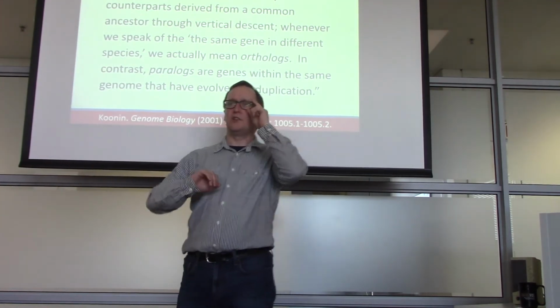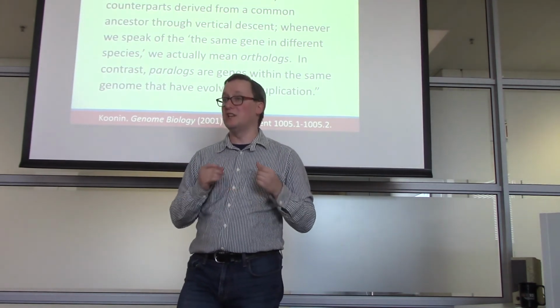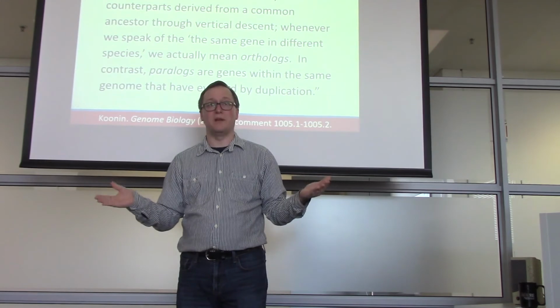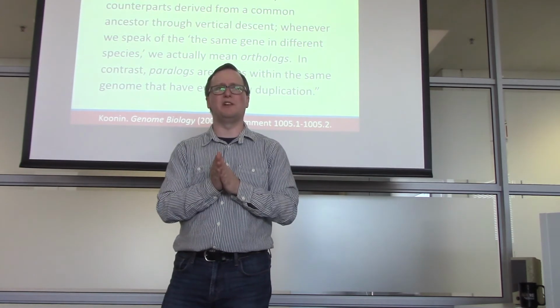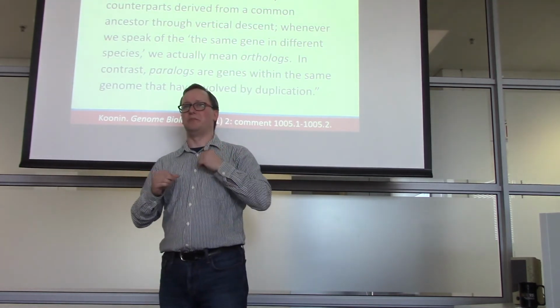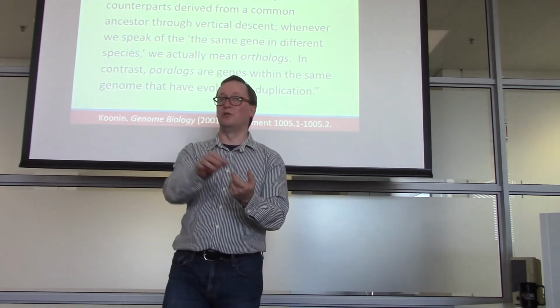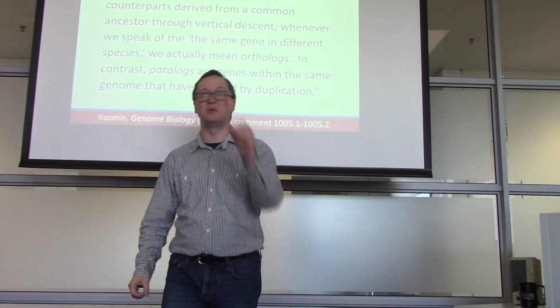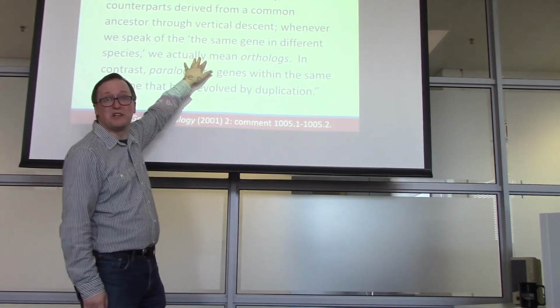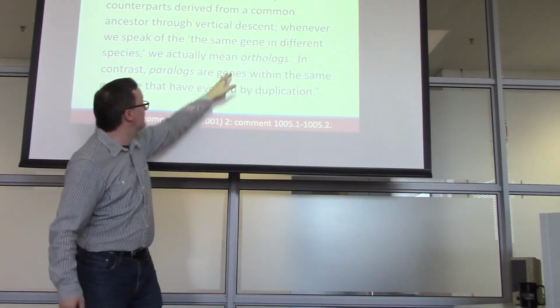So orthology is something we must think about if the sequence databases we use contain proteins of multiple species. If you were to use SwissProt as your search space, SwissProt has protein sequences from hundreds, or I think even more than 1,000 species in it at this point. So if you identify a peptide from actin in a human sample, such a database would also say, well, it's possible that this actin came from chimpanzees or from bonobos or whatever. So being able to deal with situations like that matters. Being able to deal with orthologs, where we have the same protein occurring in multiple species, matters.